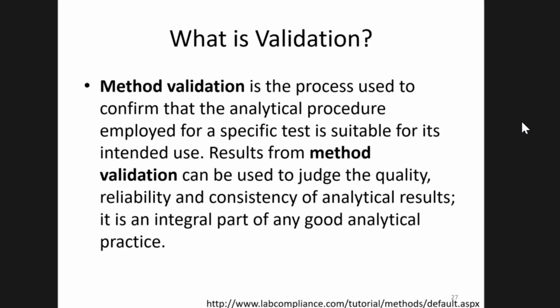The validation we're talking about is not as rigorous as that for what we're doing, and I don't measure things in people samples. I don't do diagnostic measurements. That's something more along the line of what Andy does, and so he will be much more rigorous than what I am doing. But what I am doing is trying to make sure that my results are as accurate and precise as possible during this evaluation step.